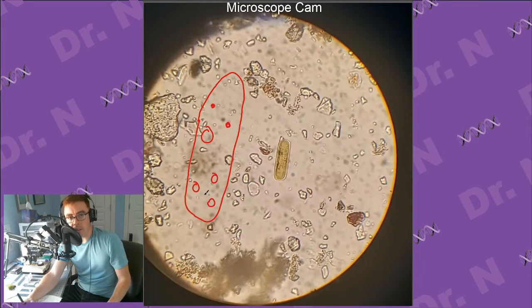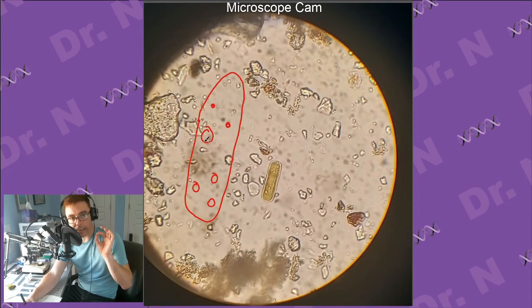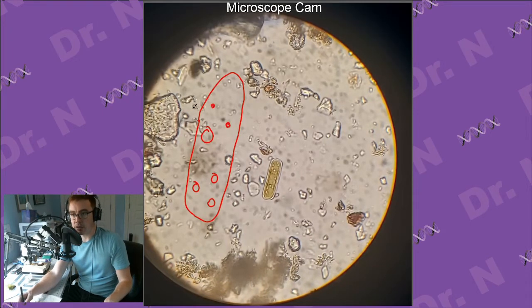What you can't really see from this camera is that these, oh, I don't know why everything just shifted. They are a much more specific, it's hard to describe, a different green color. This is sort of like a sickly yellow green. That looks like it's just the cytoplasm, the inside of the cells. I don't know necessarily why it's that green, but inside these spheres, it's a much more bright green. To the point where I actually wonder if the color filter that I have on this is making it harder to see on the stream, but not on my camera itself, or not the eyepiece. Anyways, I think those might be chloroplasts. So those are the actual photosynthetic organelles.